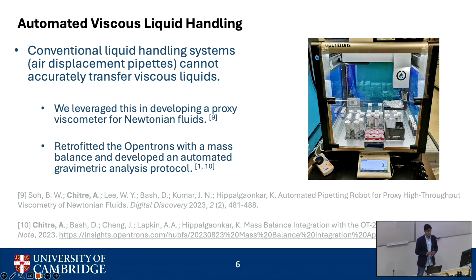And in a separate side project, I also looked at leveraging the error from air displacement pipetting of highly viscous fluids to correlate this with the fluid's viscosity itself, and developed a high throughput proxy viscometer for Newtonian fluids, which was published in Digital Discovery.